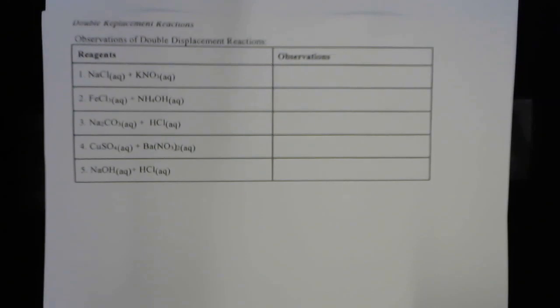Some of you, these are the same ones you were going to do yourselves until we had to shelter in place and start this temporary remote instruction mode. So these reactions are the ones described in your lab manual beginning on page 139 and then going through page 150 plus 151, I guess.